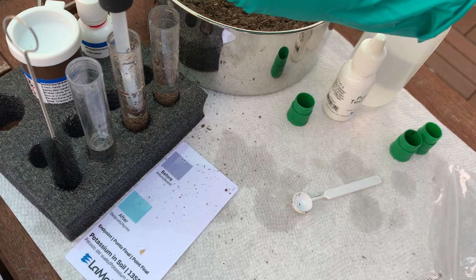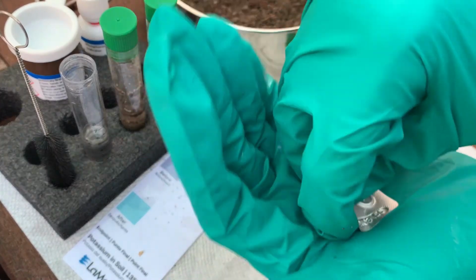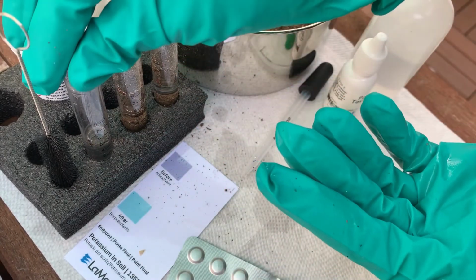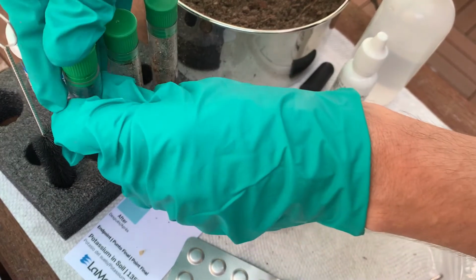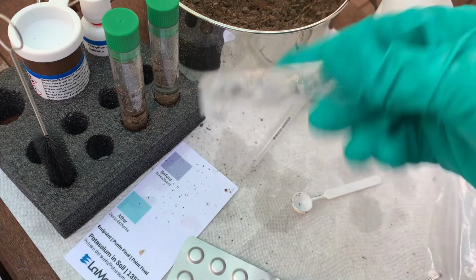Now we use a potassium indicator tablet, 1 tablet, to place into the test tube with the soil extract. We're going to cap that. And once again, we will mix this until the tablet dissolves. And when it does, a purplish color will appear. And that purplish color should match the top square on their chart.